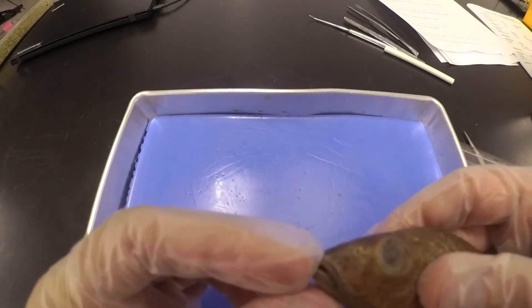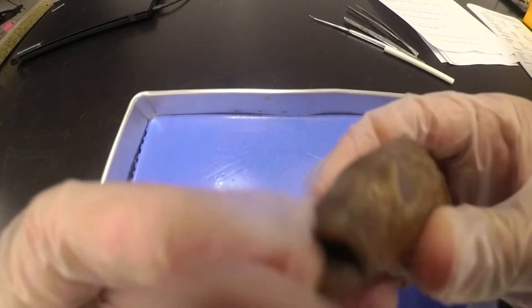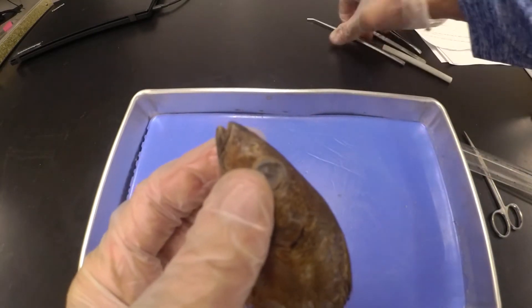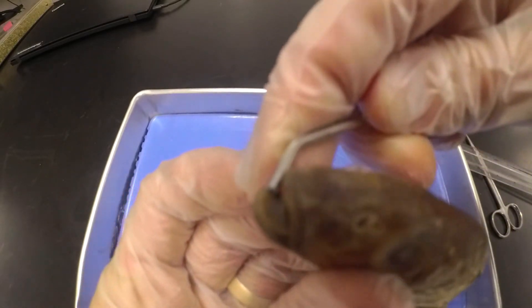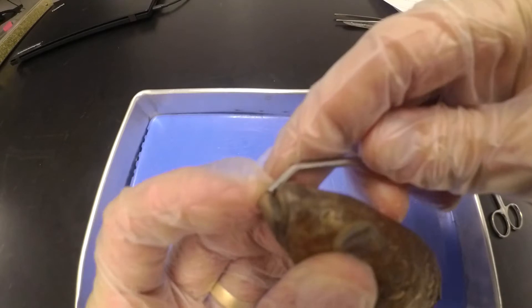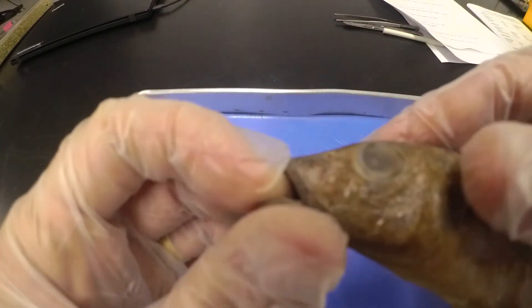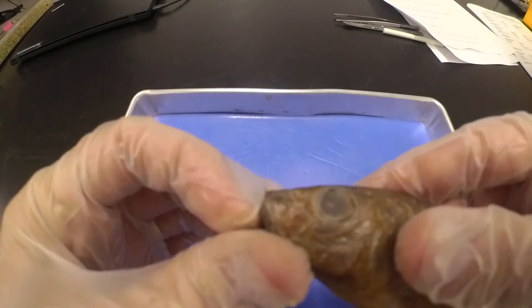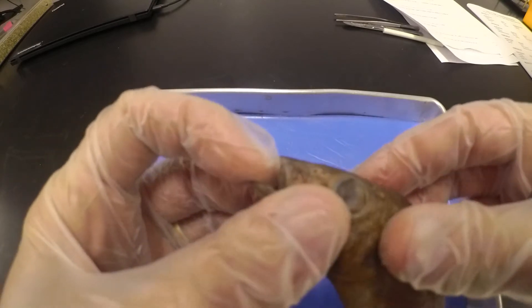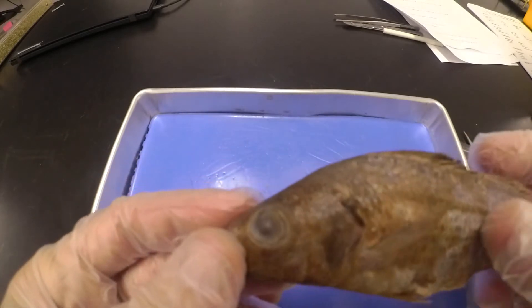Next we want to look inside his mouth. If we look inside, you can see he's got some teeth in there. If we open it closely, you can see those teeth point back into the mouth — that's to help capture food and draw it in, keeping things from leaving his mouth. So he's got these teeth pointed backwards to help draw food into the mouth and keep it from swimming out since he's in the water all the time.